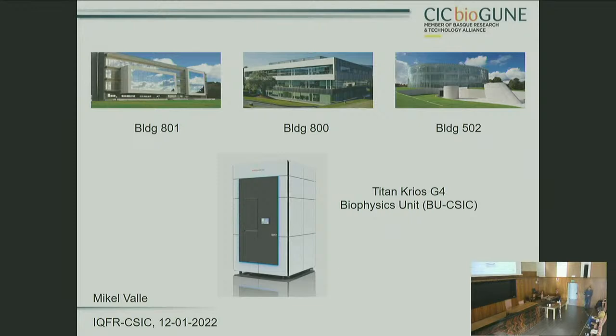And we have a novelty that is not in our building, it's in the biophysics unit, but it's just installed. It's a Titan Krios G4, which is the best equipment you can use nowadays for cryo-electron microscopy, and delivers very high resolution in routine work. So this is going to change our life, definitely, because probably everyone is aware here that cryo-EM has had an explosion in the last 7 years or so, and it has been kind of difficult to cope with this, to deliver high-resolution structures when you don't have a high-resolution electron microscope around.